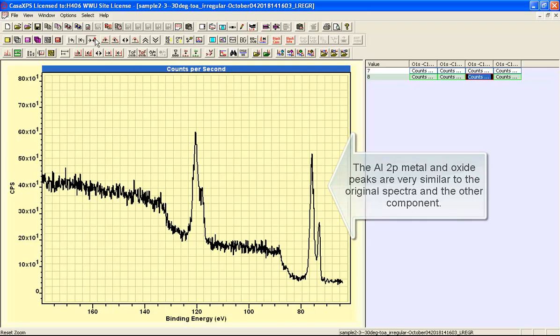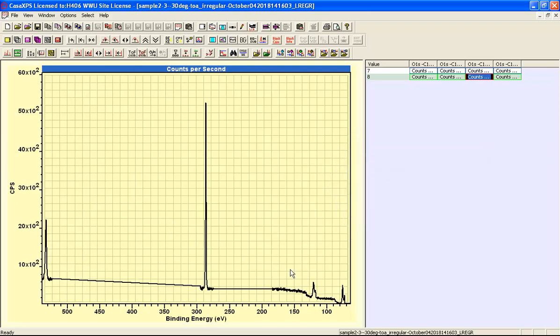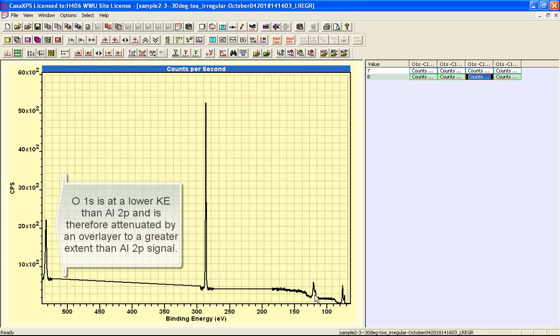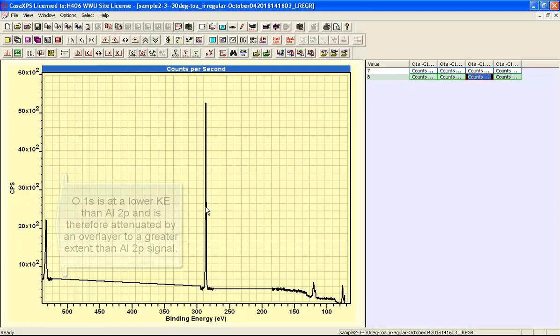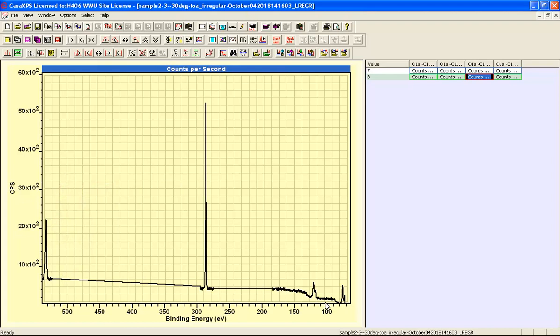However, when we look at the ratio of the oxide from the aluminium, which is at a lower kinetic energy, there does appear to be attenuation of this oxygen signal relative to the aluminium. We also have a very strong carbon 1s. So put together, this would suggest that the aluminium as seen here is buried beneath a layer of carbon.